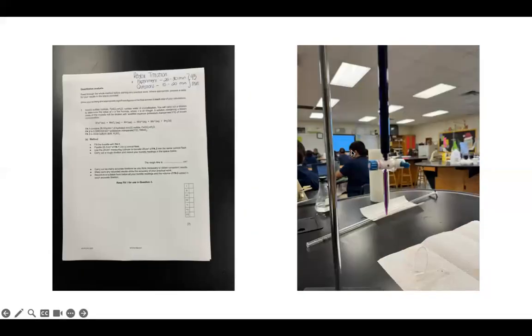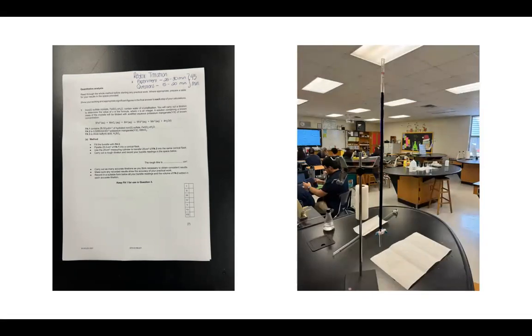When filling the burette, you need to make sure that this area at the bottom has no air. If it has air, just open the burette slightly over the sink to purge it of any air. This process is known as purging the burette. In the burette, you need to make sure that there's only FA2, or the solution that you need. If there are any air bubbles, you can flick them out using your fingers. However, if they're still there, you're going to need to pour all the solution back into the beaker and then fill it again with no air bubbles.